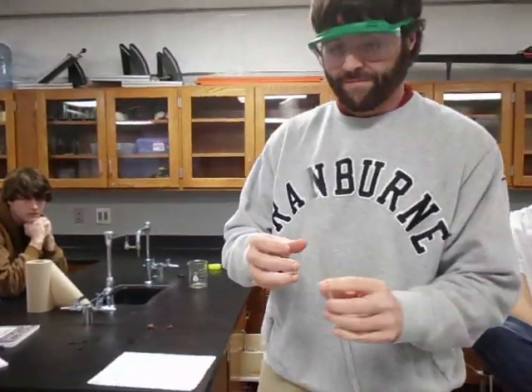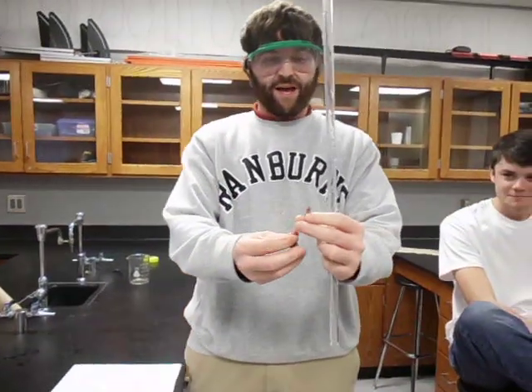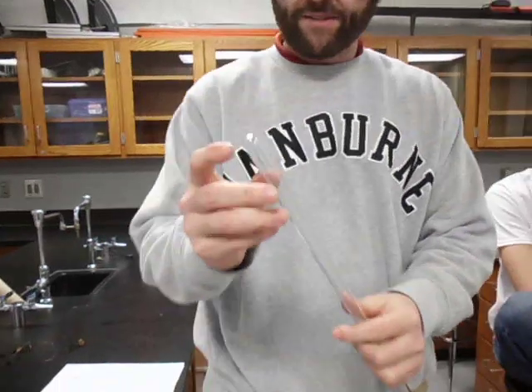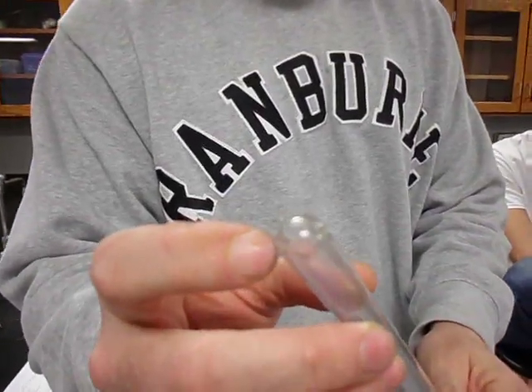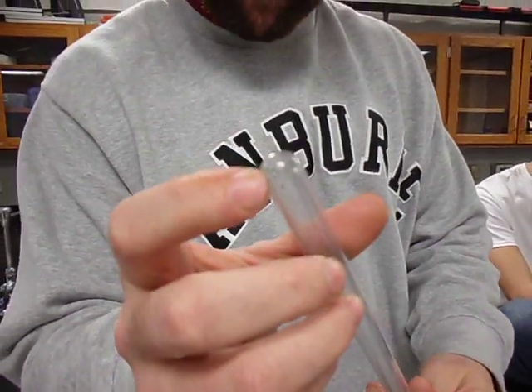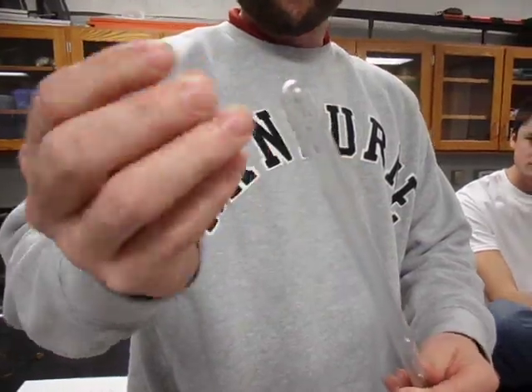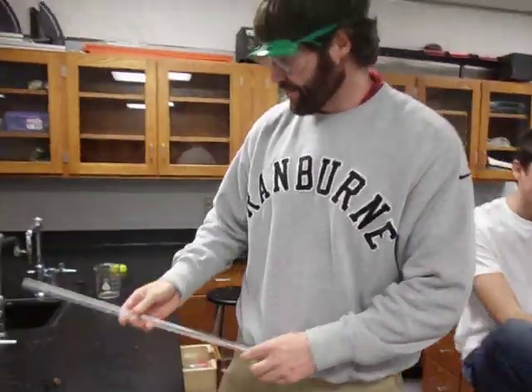Today we're going to be doing the ideal gas law lab, and we're going to be using a eudiometer. What makes a eudiometer different from a gas collection tube is there are little metal electrodes in the end of it — although these have been flattened out. They're actually made to arc and cause a reaction in the gas.